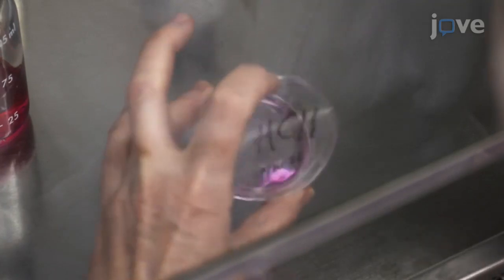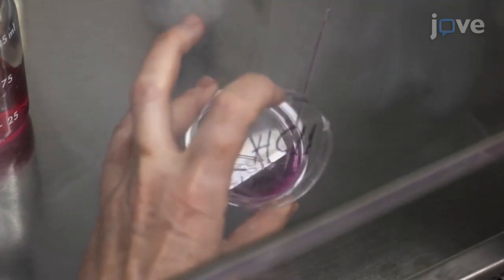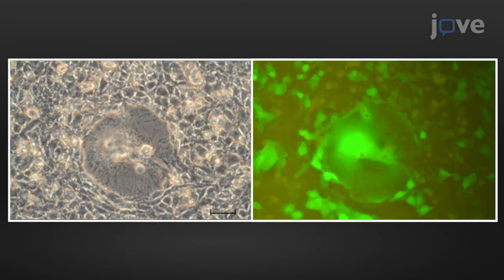For example, the small GTPase RAC and other molecules may trigger transformation of breast epithelial cells when expressed to high levels, but surprisingly, at low levels, they may induce differentiation. Other signal transducers may behave in a similar manner. The principles may apply to other types of differentiation as well, where cell confluence plays an important role. For example, differentiation of adipocytes or myotubes.